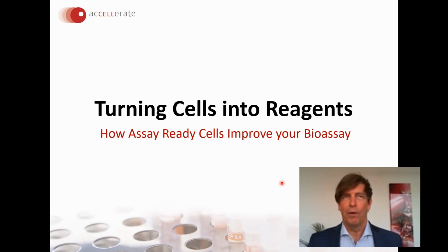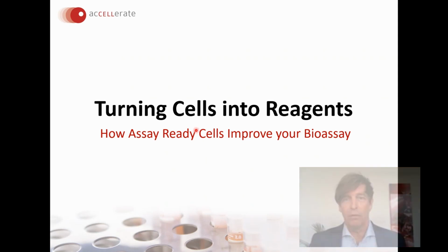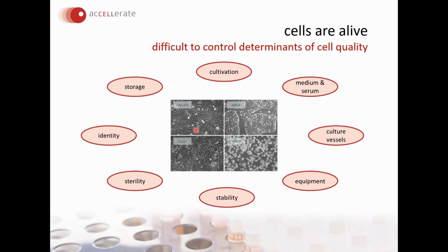front. This is an approach which has first been introduced in the drug discovery field in high throughput screening back in 2004, and has now been widely accepted and adopted also for bioassays because it actually has a lot of advantages. I assume that you're all, or most of you, working in the field of cell-based assays, so you probably all know that there are a lot of factors which have an impact on the quality of cell-based assays.